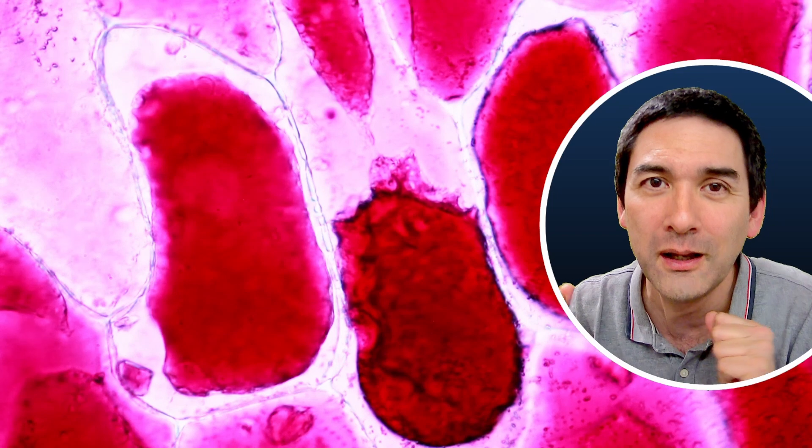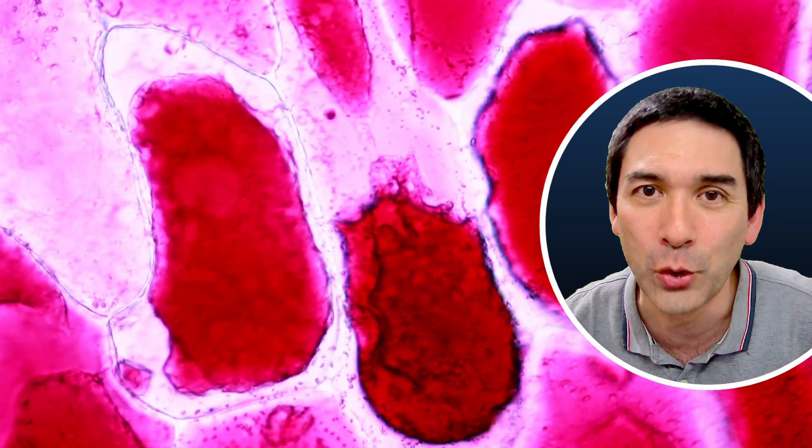And this process can, as a matter of fact, also be reversed if you add again some fresh tap water and you flush away and you clean away all of the salt and the whole process is going to be reversed. If you're interested in observing this, there's a link to another video that I made at the end of this video here. Here, look what happens. Here again, it starts to shrink and then the contents of the cell starts to become a little bit darker because the pigment becomes more concentrated.